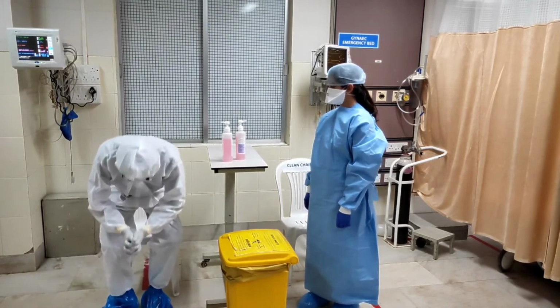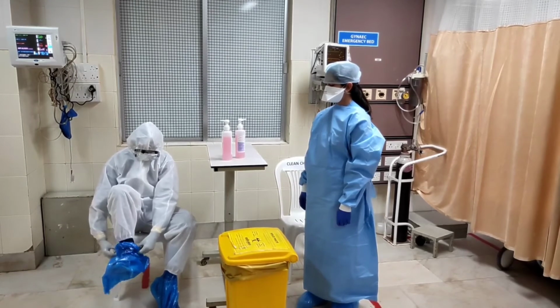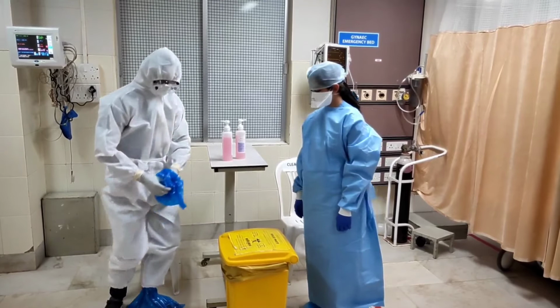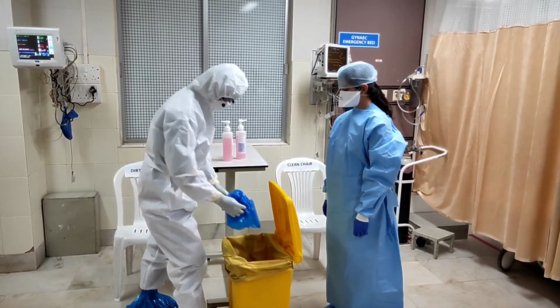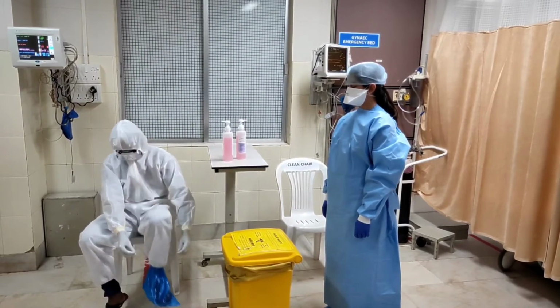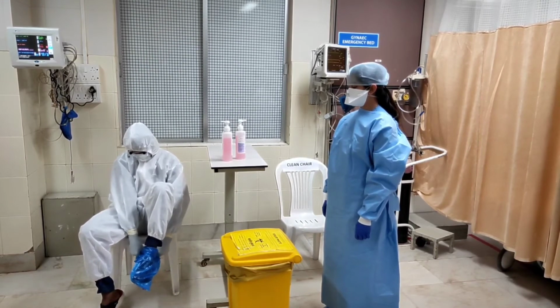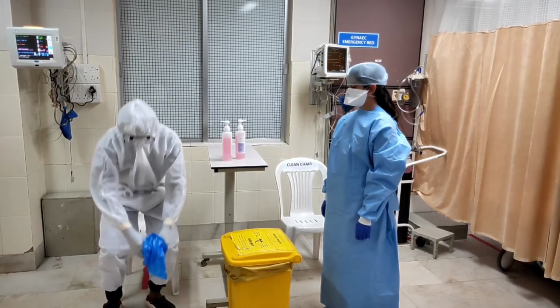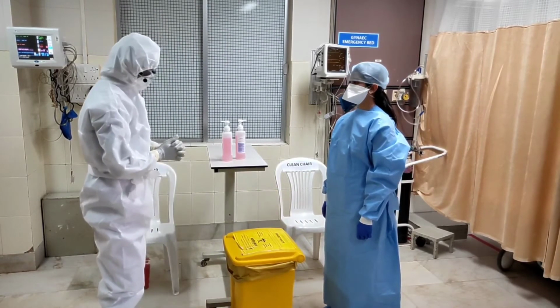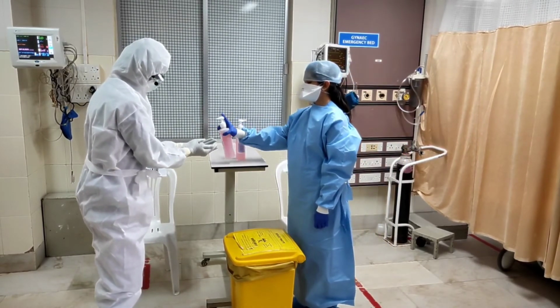You can sit in the dirty chair and remove each shoe cover respectively and then dispose of them into the labeled biohazard bin. Make sure when you remove the shoe covers, the removed shoe covers are not touching any other part of your body. Now again disinfect your hands with hand sanitizer.